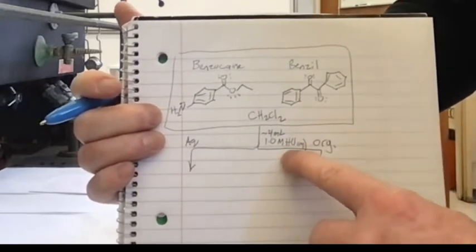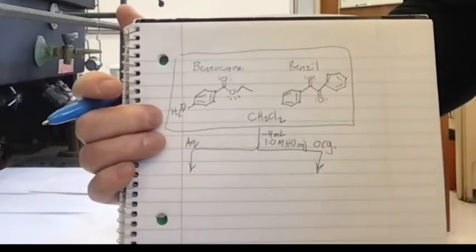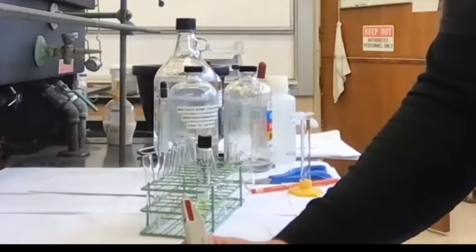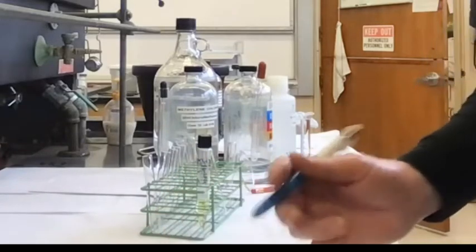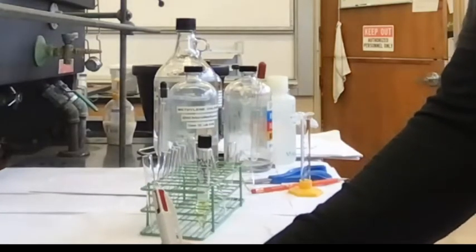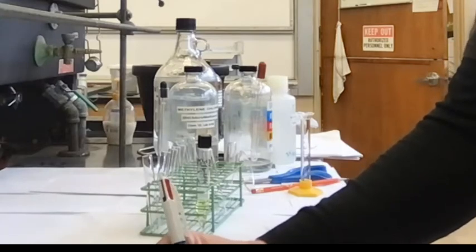And then what else does it have besides water? Hydronium. And what else? Chloride. Yeah, chloride. All right. So we're going to have mostly water over here, chloride and hydronium.